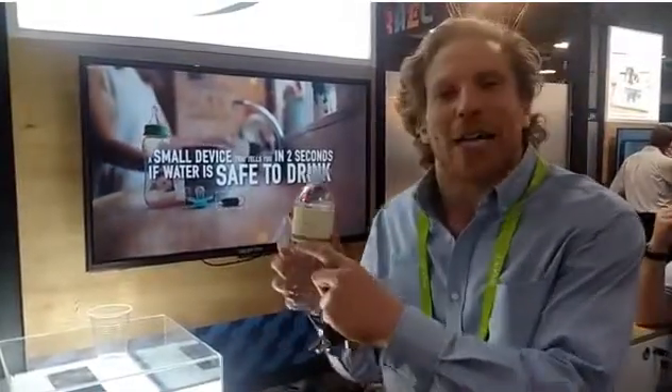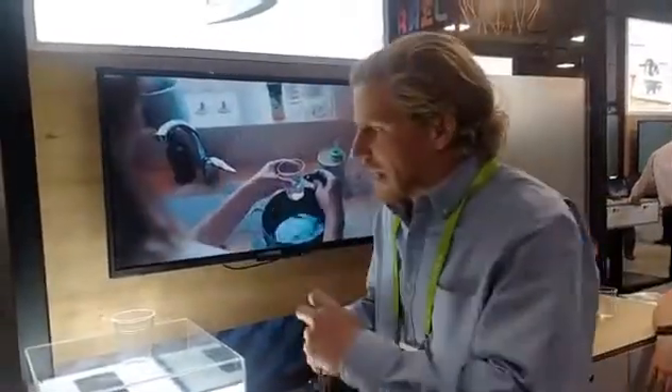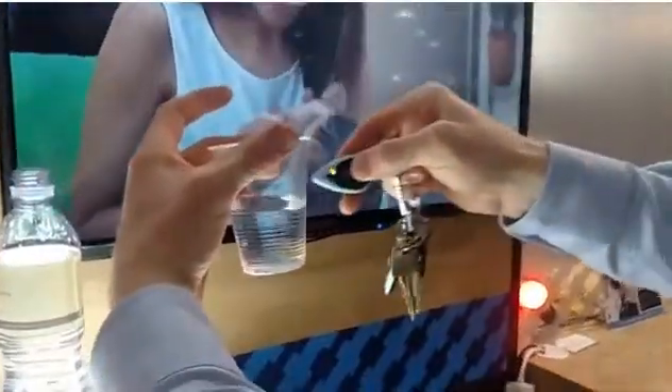We're at the Sands Expo Center at CES 2018. You see a lot of people walking around with a bottle that says purified water — it's from the Venetian Palazzo and Sands Expo. Since we are Listoat, a company that is testing water quality using our Test Drop Pro, so you can test water and know in two seconds if you have contaminants like metals, chemicals, and bacteria, we decided to test this purified water that everyone's walking around with to know if it's good to drink or not. I'm going to put it into a cup, swirl it around a little bit. And we get a blue light — that means the water isn't contaminated and it's good to drink. So cheers, everybody at CES 2018. Have a good glass of purified water from the Sands Expo. Cheers.